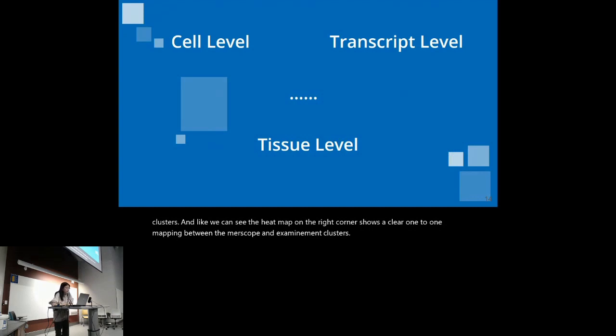So to summarize, there is a lot more that was not mentioned, including the cost, experimental workflow differences, process of data acquisition, cell segmentation pipeline, and many, many more. In short, to conclude, we think that the amplification of RNA signal is essentially important for recovery of transcript counts by spatial transcriptomics technologies, especially in some low-quality samples where RNA might be highly degraded and fewer landing sites are available for probes.